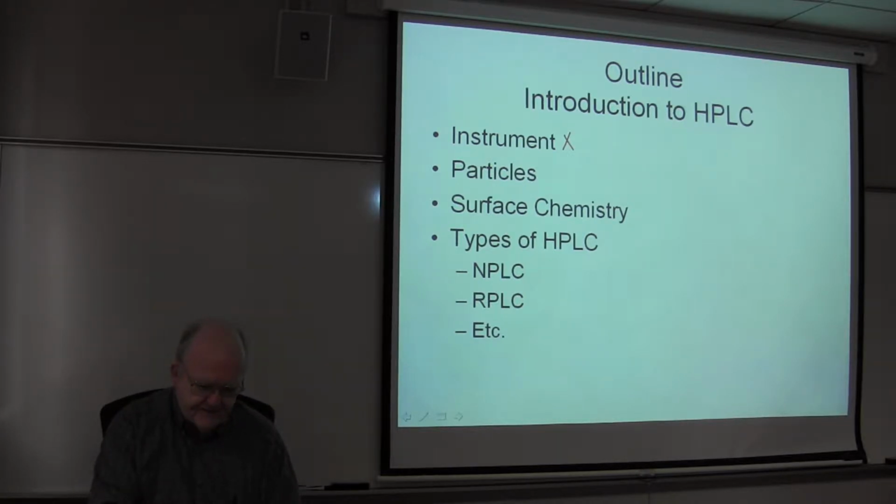And then the rest of today we'll talk about the different kinds of particles used in HPLC. And we're going to spend a lot of time talking about the surface chemistry, especially of silica. Probably 90% of all HPLC uses silica.